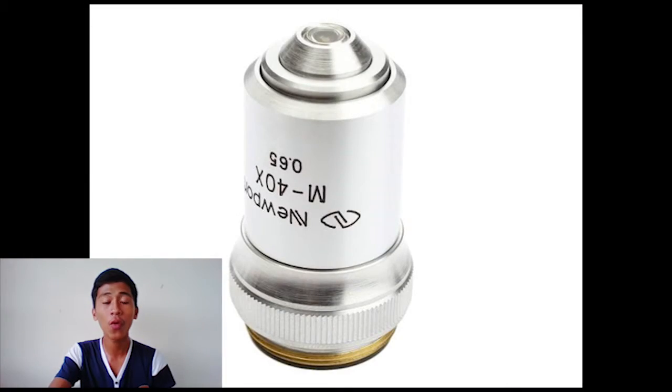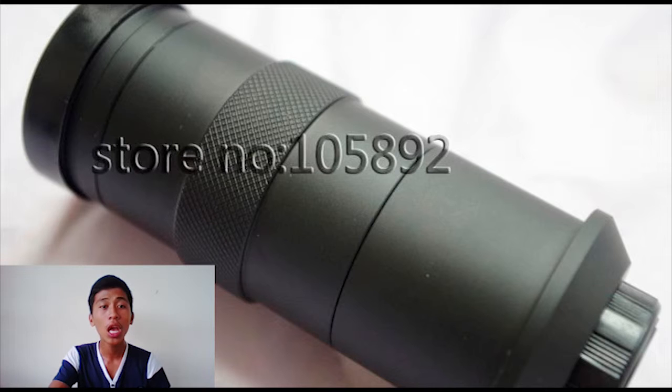Let's come now to the magnification of the microscope. When we say magnification, it means enlarging objects to make them clear or visible to our eyes. So if you have a microscope at 40 times magnification, you will be able to see a 5 mm object. At 100 times magnification, you will be able to see a 2 mm object.